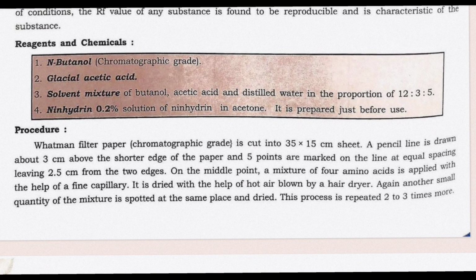Procedure. Whatman filter paper, chromatographic grade, is cut into 35 by 15 cm sheet.